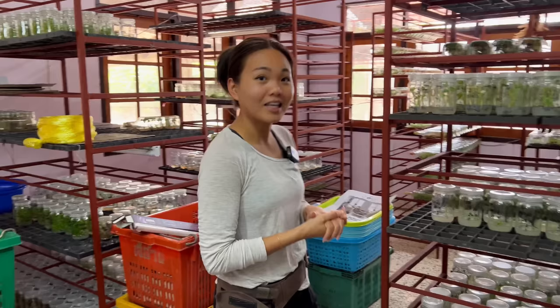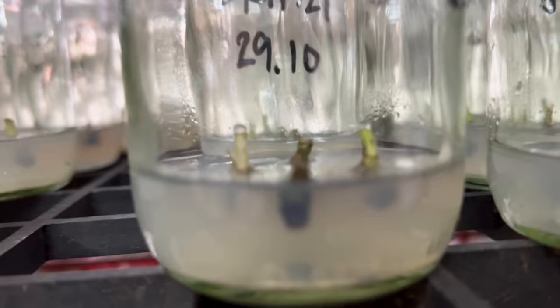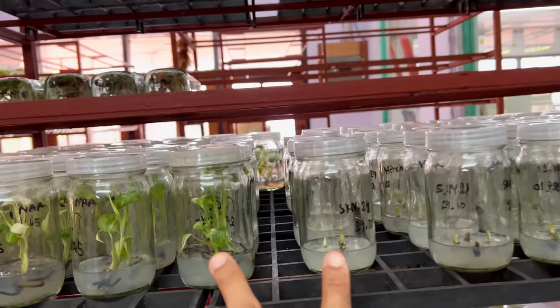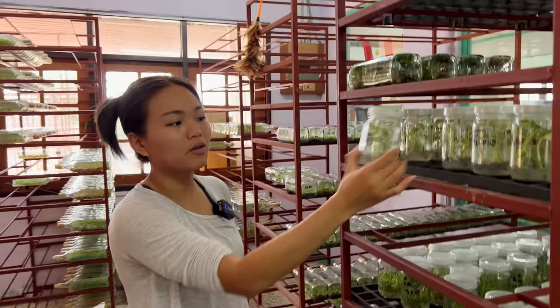Here are all the Taikons — you can see they went from that to that. How long does it take roughly? About nine months. We will keep them in here. We sell them in flask sizes — sometimes a bottle of three, bottle of one, a big bottle of ten or forty, depending.